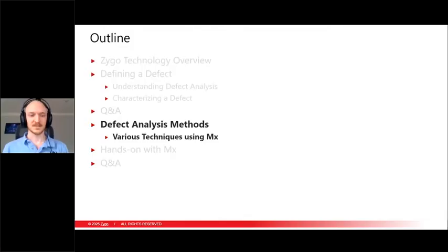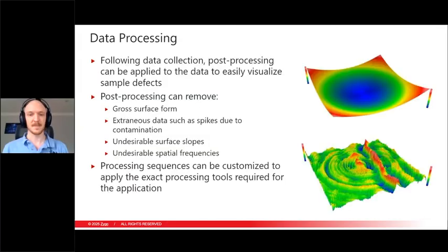So now I'll jump into different methods of defect analysis and techniques using MX. And what we'll want to start with is a very basic overview of data processing. Data processing is going to be something that's included in almost all of your data analysis in some way.